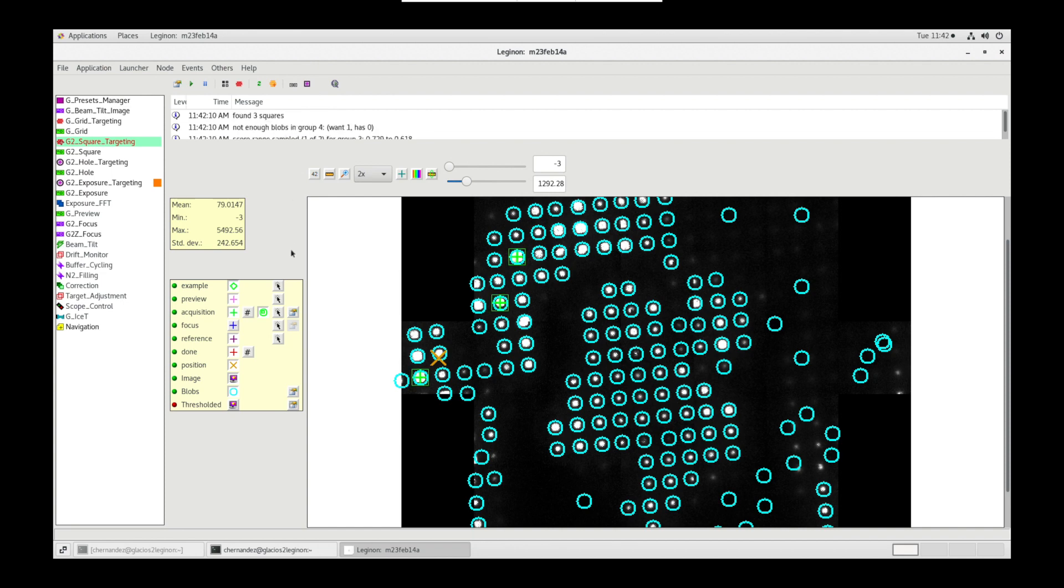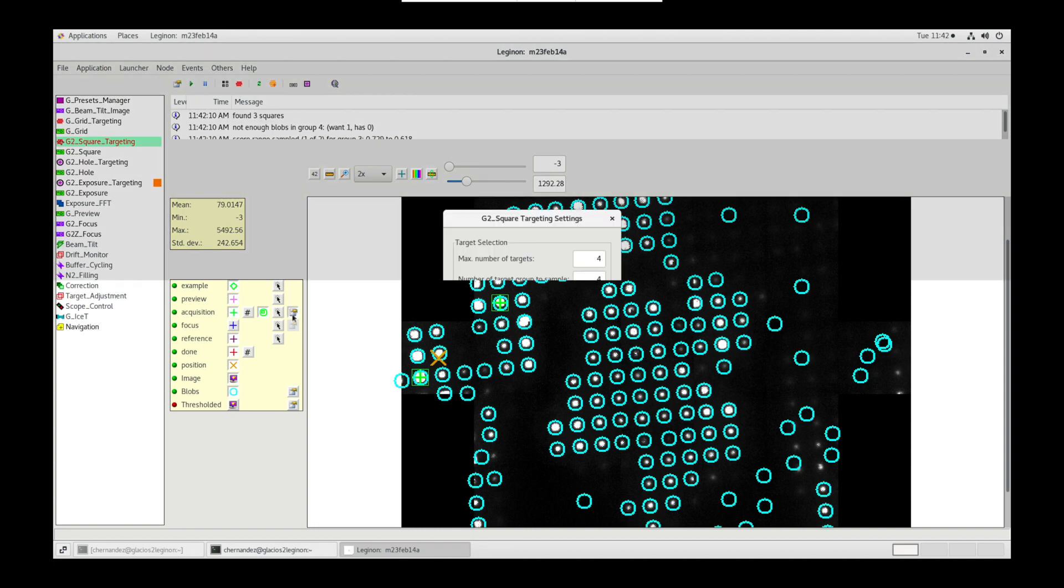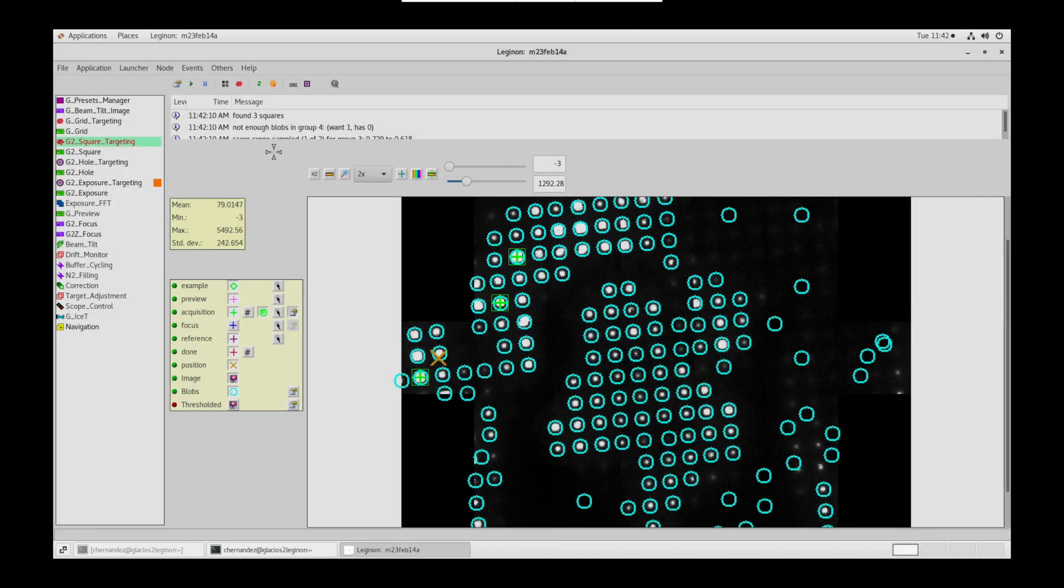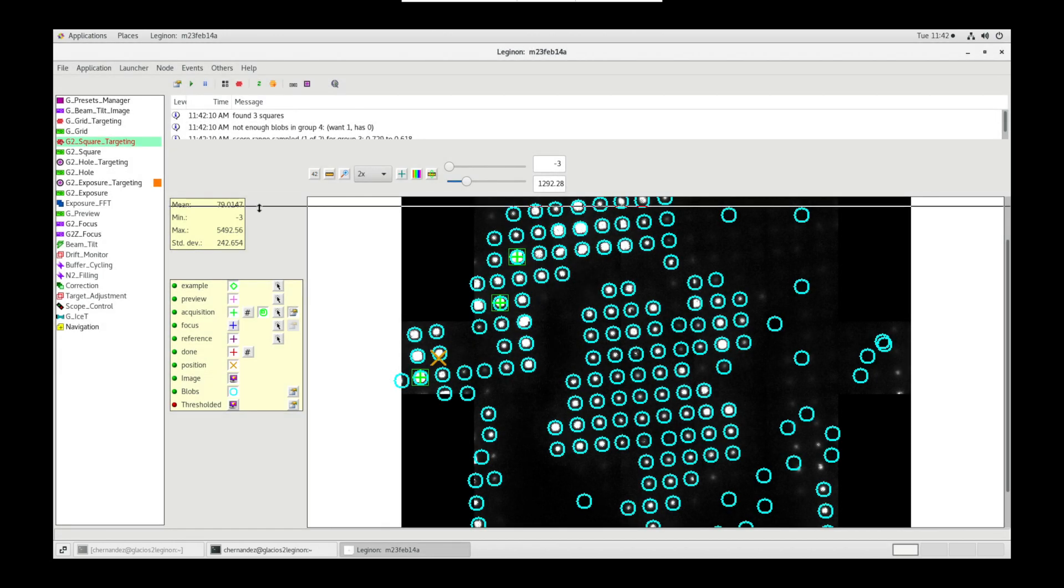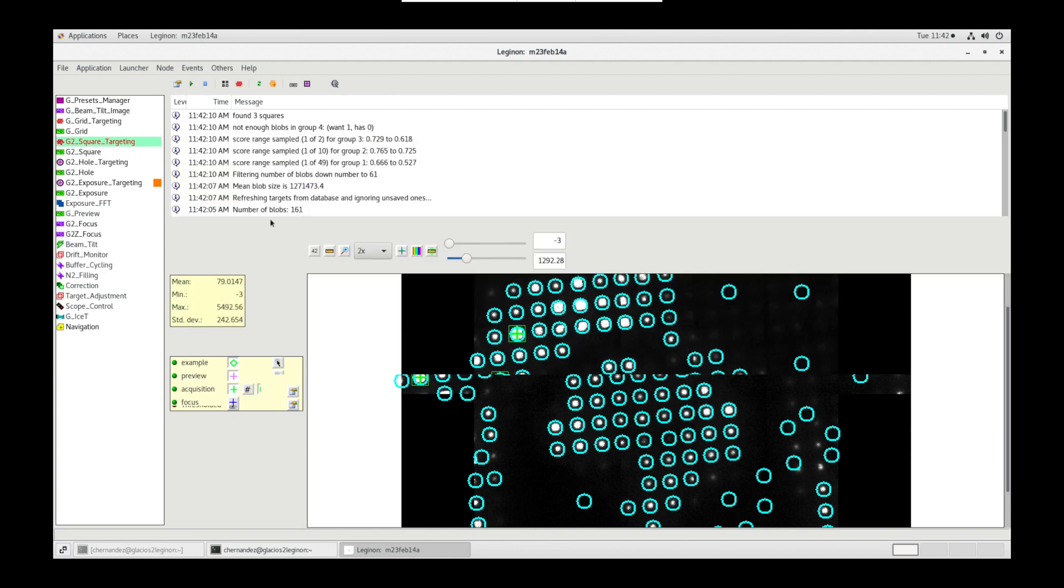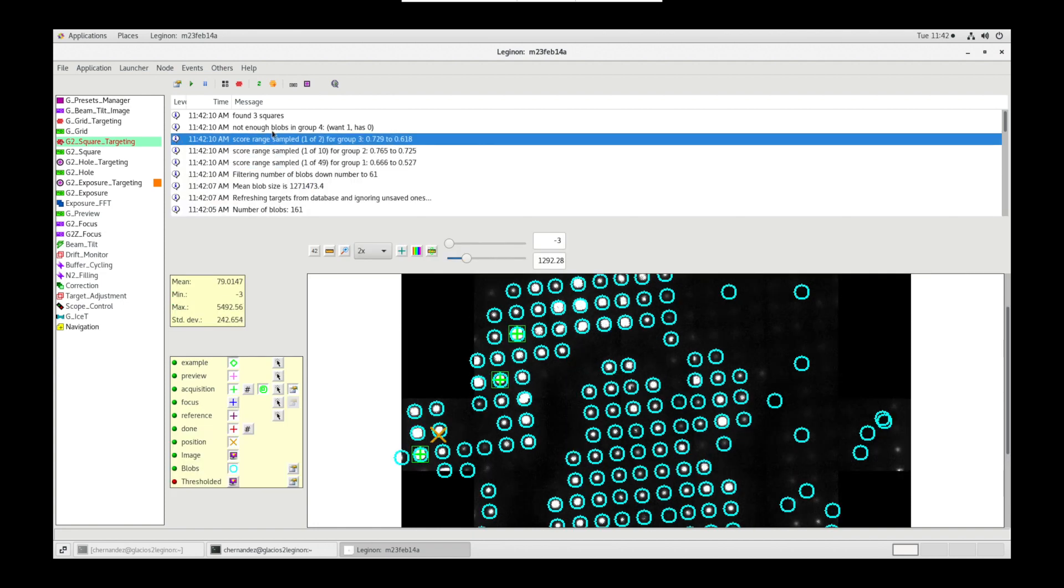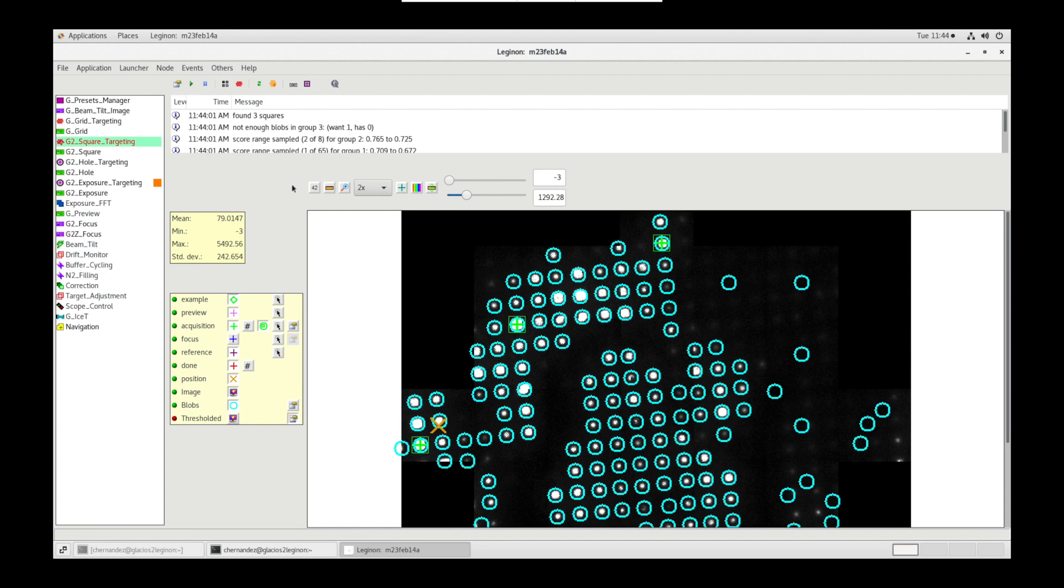In acquisition settings, we can change the number of targets and how many groups Ptolemy creates among the blobs to target. Ptolemy bins the blobs into groups based on their scores. In this case, there aren't enough blobs in group 4. We can attribute the blob sizes to ice thickness. Once satisfied with the parameters, click submit targets.